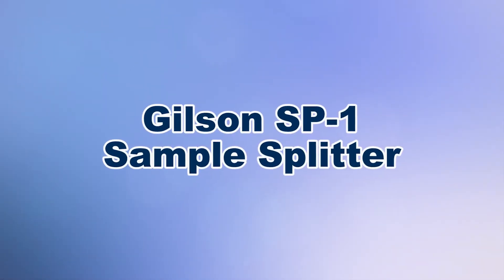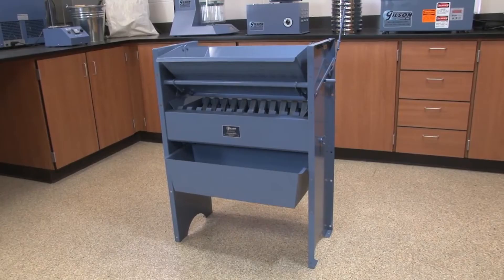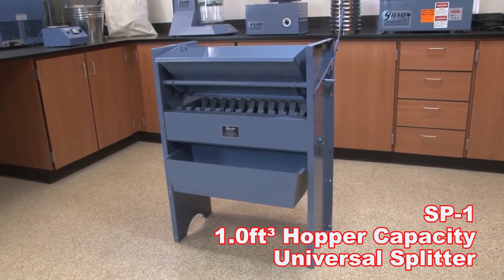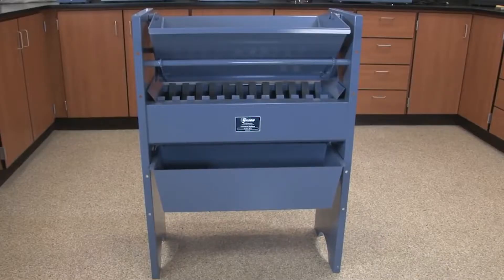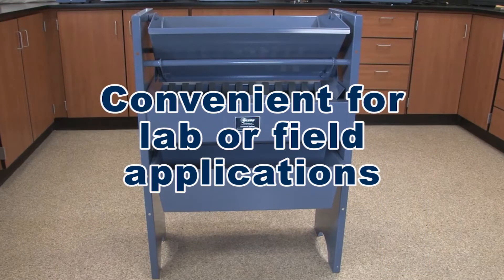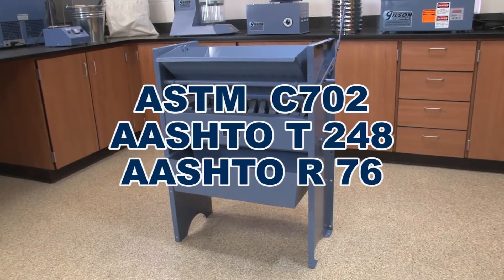When you need repeatable and reliable representative sampling, Gilson is your best choice. The Gilson SP-1 Universal Splitter is a rugged and large capacity sample splitter that stands 39 inches tall and is ergonomically designed for loading large bulk samples, convenient for both lab or field applications. The SP-1 meets ASTM and AASHTO test specifications.